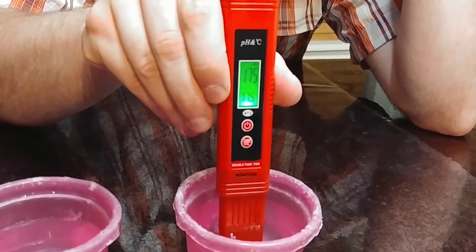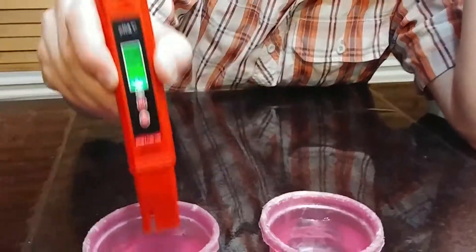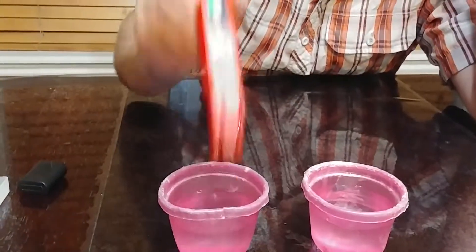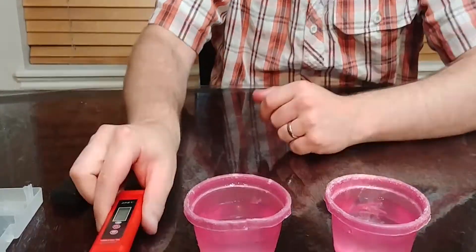Really simple, really easy to do. All you do is take it out, get that liquid off, dry it off with a little towel, put the cap back on, turn it off and you're done.